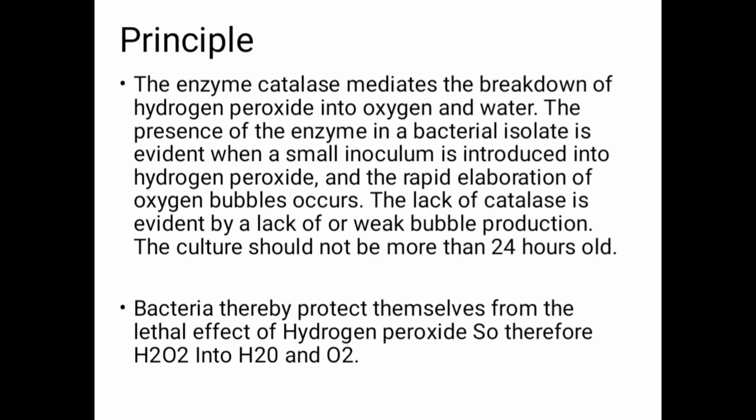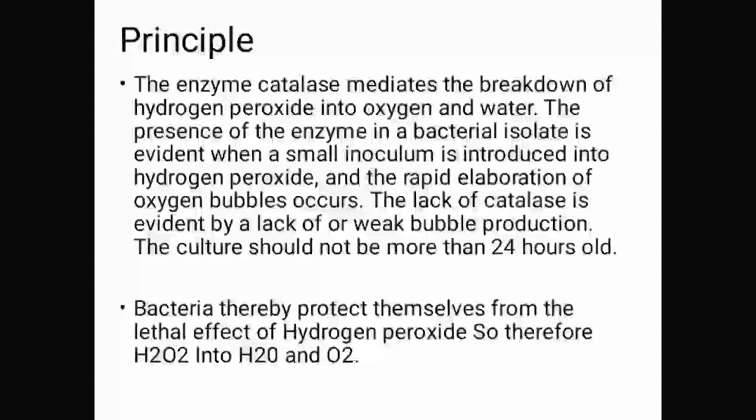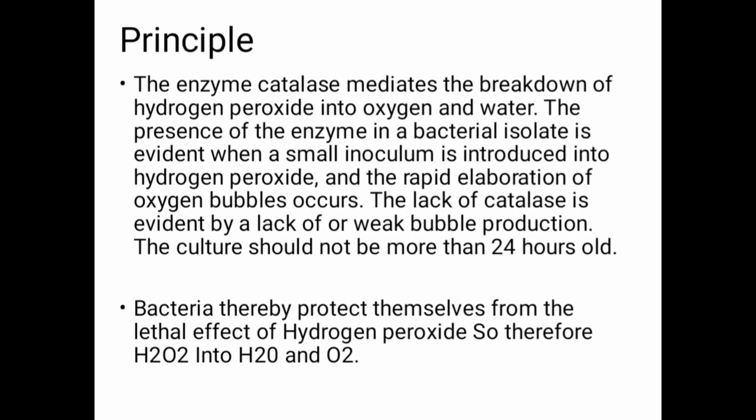So basically we know the Staphylococcus bacteria have the enzyme catalase. If they are catalase positive, this enzyme breaks down the hydrogen peroxide into oxygen and water, and as a result we have bubbles in the medium. If no bubble is found in the medium, we say they are catalase negative and it will be a Streptococcus bacteria.